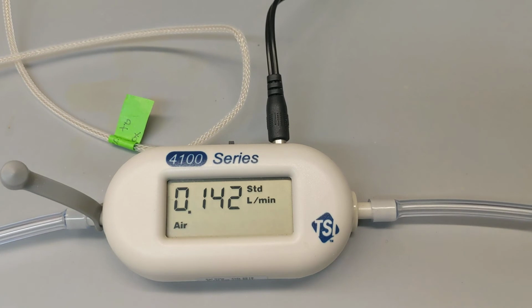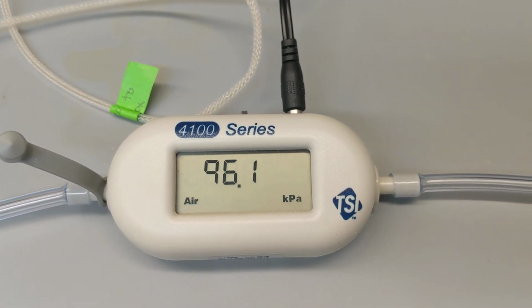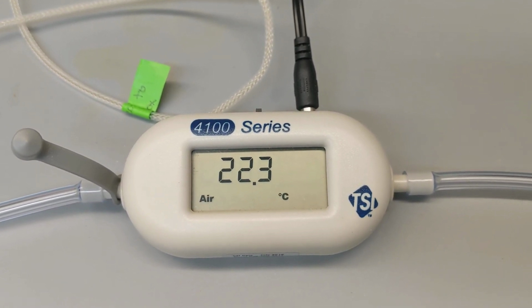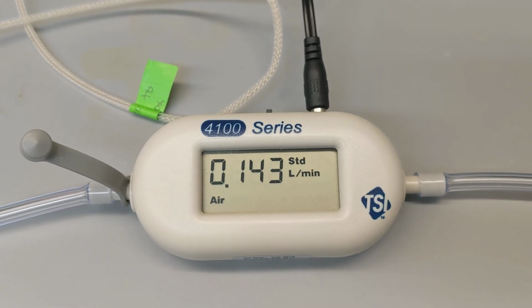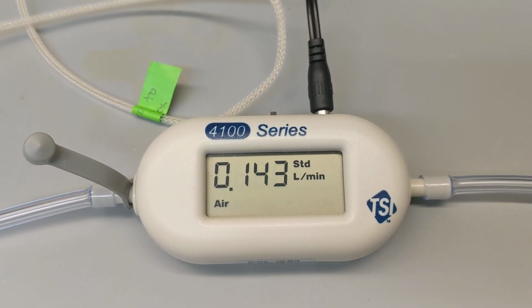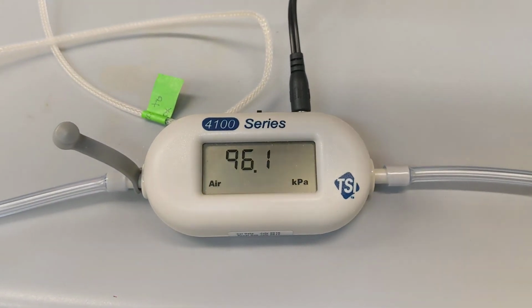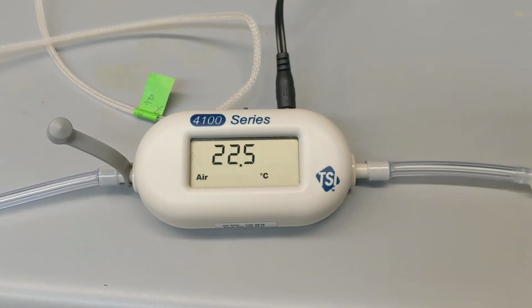And as it gets pulled that direction, I'm actually measuring the temperature of the air going through this system and also the flow rate of it. That's going to be important in some of the calculations that I'm going to show you later, but the flow rate right now is 0.143. You can see right here, 0.143 liters per minute. So again, it's being pulled from this side of the screen to this side of the screen.